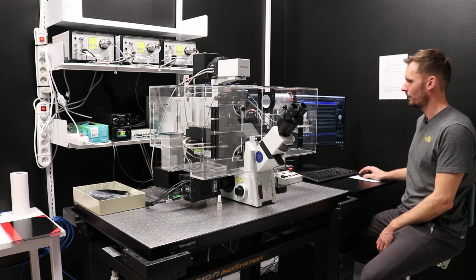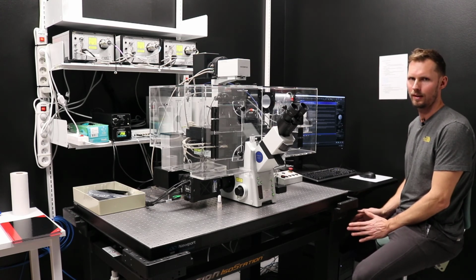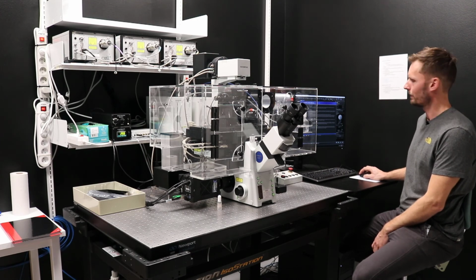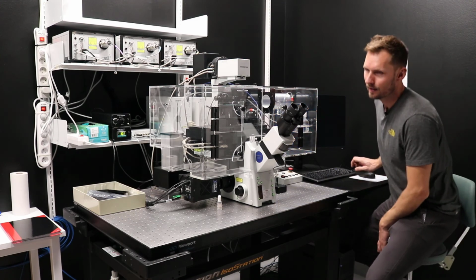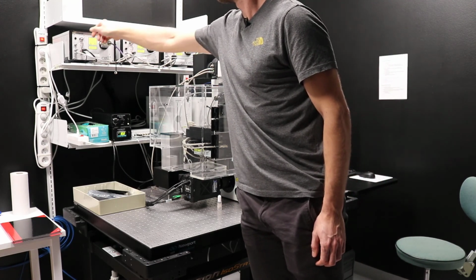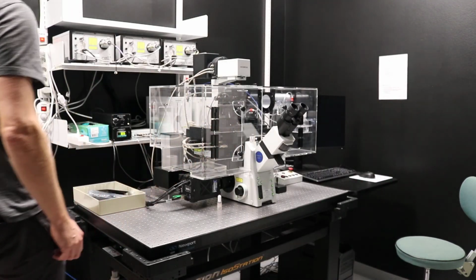After imaging, you need to take care of some parts on the system to cool down before powering off. The fluorescent light source needs to be shut down in the software, and after doing that, you'll need to leave the power on for 15 minutes. I have now shut off the light source in the software, and I close down the software and the PC. Then I go to the lasers. If I have turned them on at all, I switch them off, like this. And then I leave the system for 15 minutes and power everything off. Powering off is simply the 2 buttons on the wall.